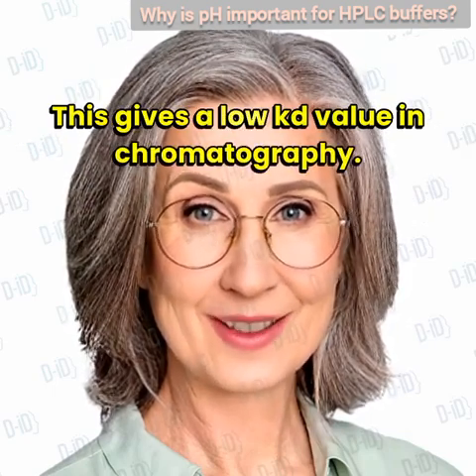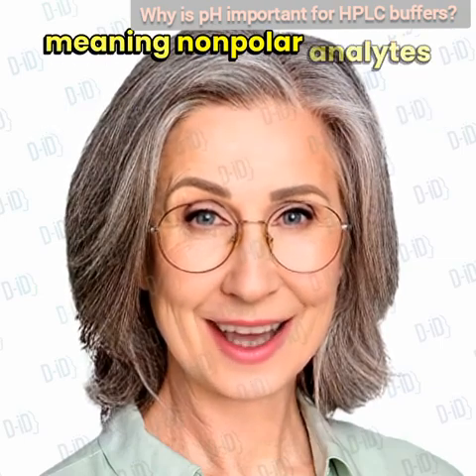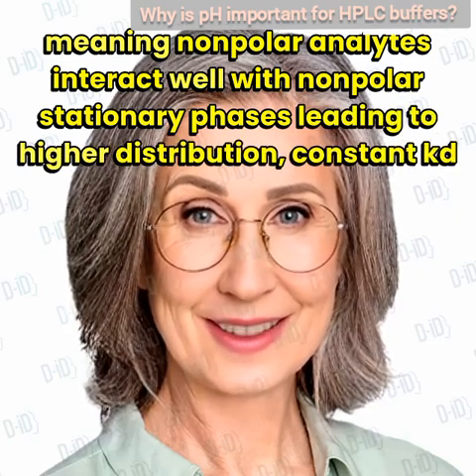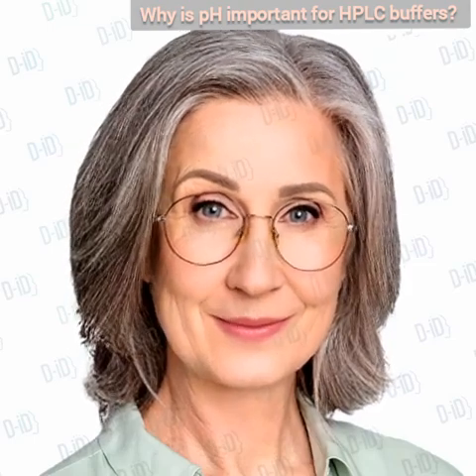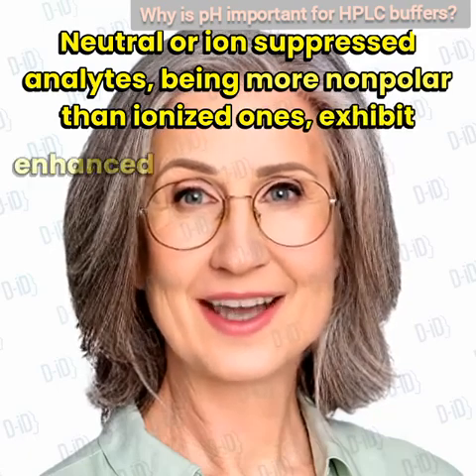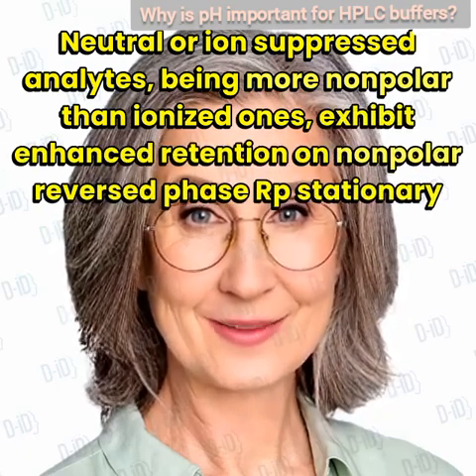In chromatography, the principle, like dissolves like, applies, meaning nonpolar analytes interact well with nonpolar stationary phases, leading to higher distribution constant, Kd, values and improved separations. Neutral or ion-suppressed analytes, being more nonpolar than ionized ones, exhibit enhanced retention on nonpolar reversed phase, RP, stationary phases.